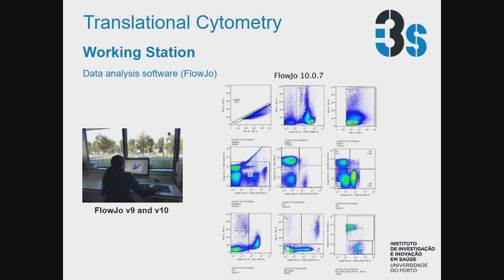We also have a workstation where you can analyze your data. You just need to book the workstation, and there we will have a computer with a license of the software. The software that we mainly use is the FlowJo software.